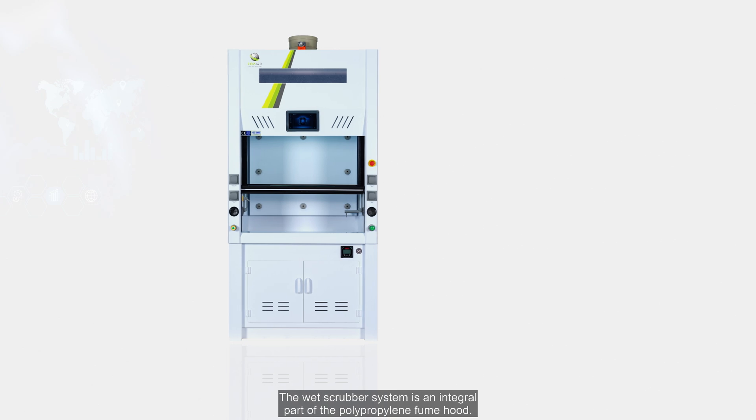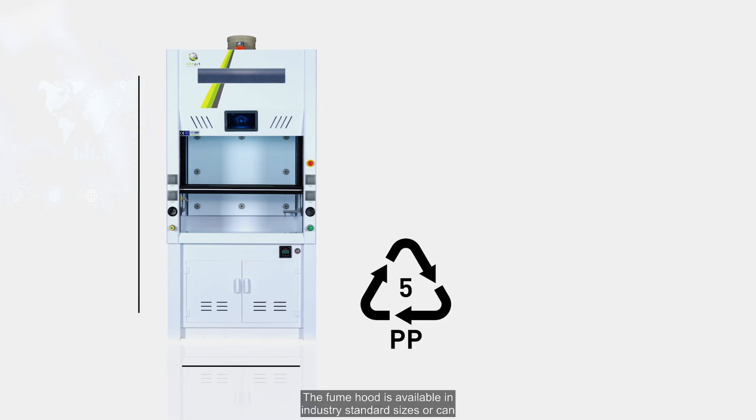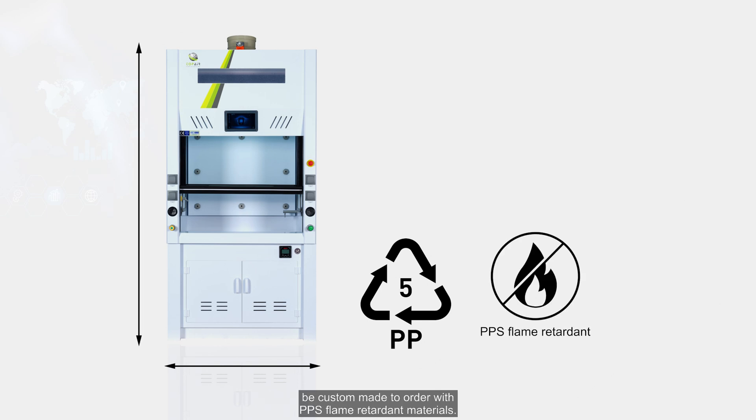The wet scrubber system is an integral part of the polypropylene fume hood. The fume hood is available in industry standard sizes or can be custom made to order with PPS flame retardant materials.